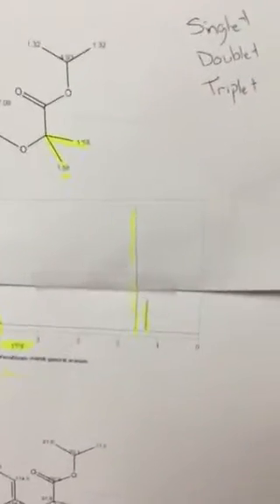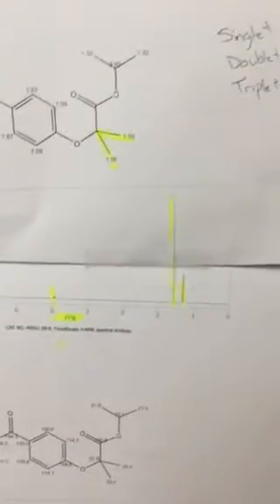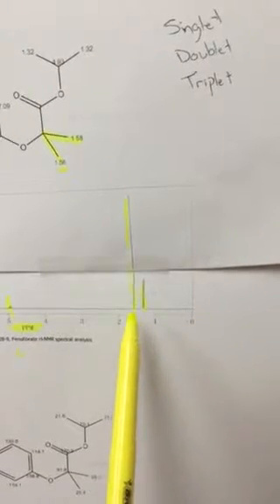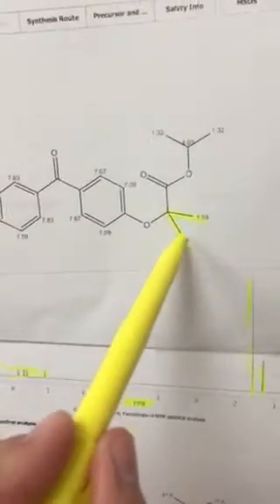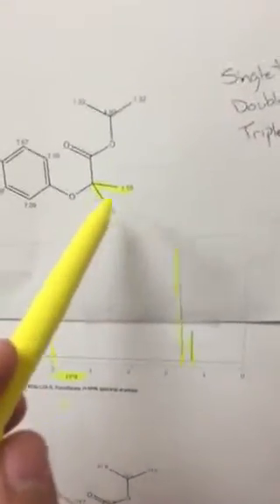So if we're looking at it here, we see a signal right here. This is a tall peak. We got another one over here. We have a few more right around this area. ppm stands for parts per million. But like I said, these signals are letting us know where the hydrogens are breaking off. So right here, I would say it's right around 1.6. It's just past 1.5. It's right around 1.6. So if we go back up here into our skeletal structure, we see that these hydrogens off these carbons are CH3s off these carbons, they are giving off that same signal. So we know that this peak is designated to these hydrogens breaking off. And from that, we can determine functional groups as well.